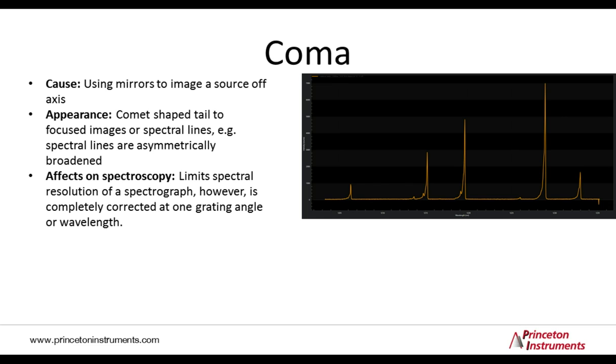Oh, I'm sorry, I forgot to switch the slides again. Let me revert back. So coma, let's look at the slide once more. So here are the asymmetrically broadened lines.